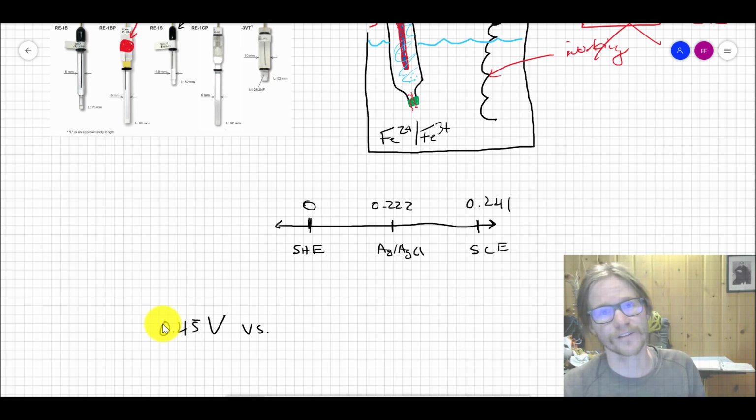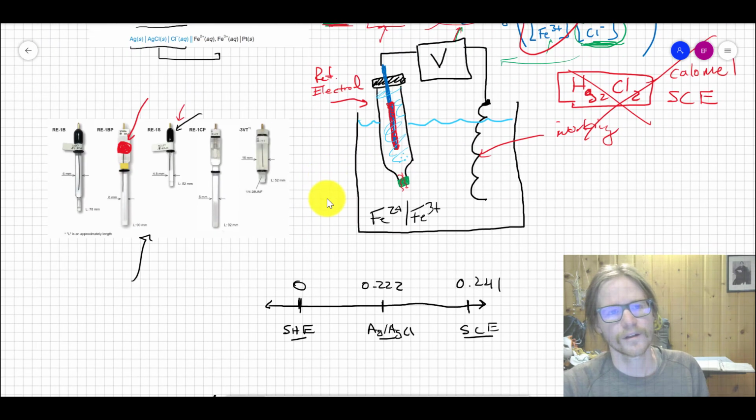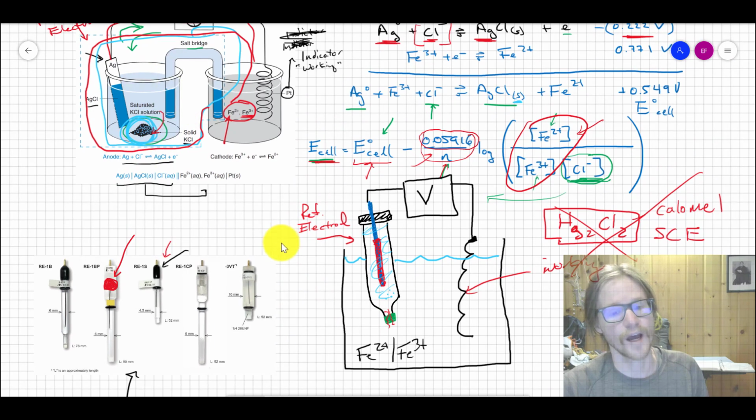And either that other half of the circuit is a floating electrode like a platinum wire that is changing, which is bad practice because it's changing, so it's a non-stable measurement, or it's versus a standard electrode, some reference cell that either you purchased like this in a prefab form, or you constructed like this in the non-prefab form.